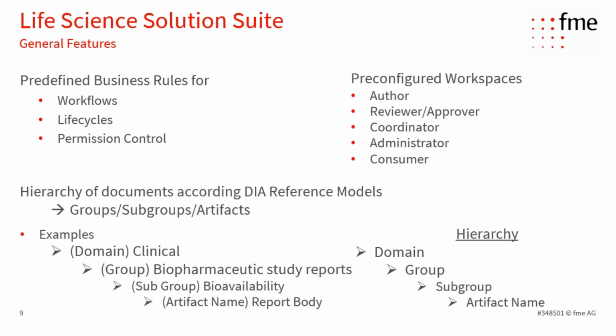These are things based off best practice, with pre-configured configurations around workflow, lifecycle, and permission control, so access rights. Also the interface and the workspace: how the user experience behaves is based on roles, so it's very role-based. Here's a short list of the roles. There are some additional ones across the different modules.